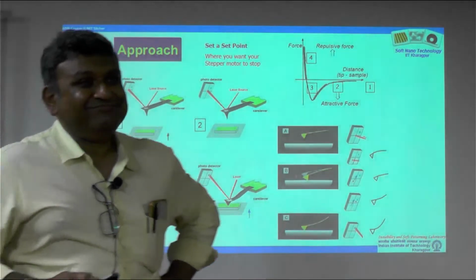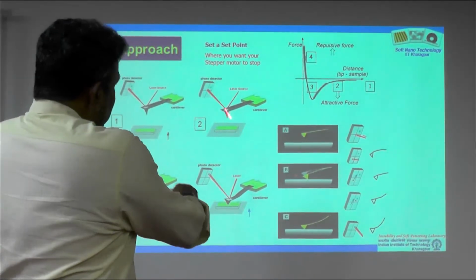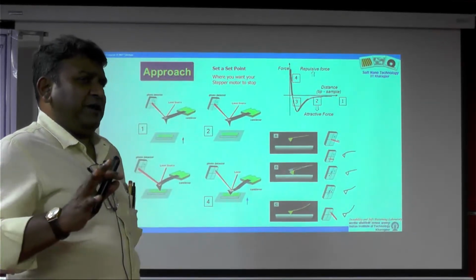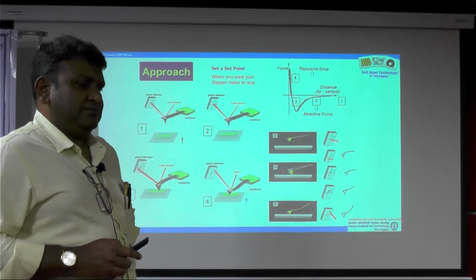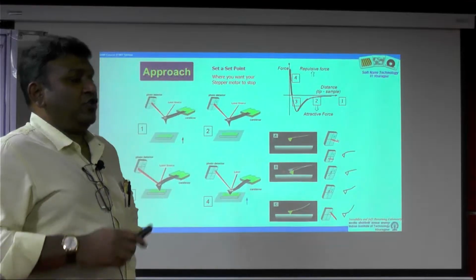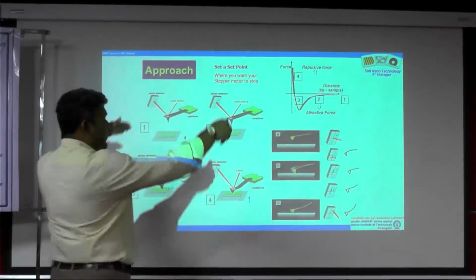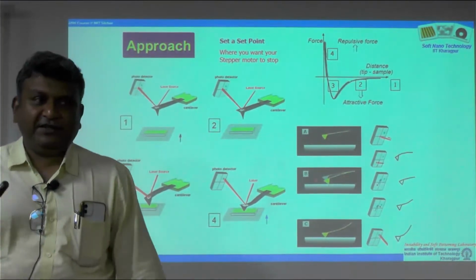That is step 2. Which one is moving? The way I have drawn it, the whole thing is moving, but it can be anything. In fact, there are atomic force microscopes where the whole assembly moves, so there is no relative displacement between the two.